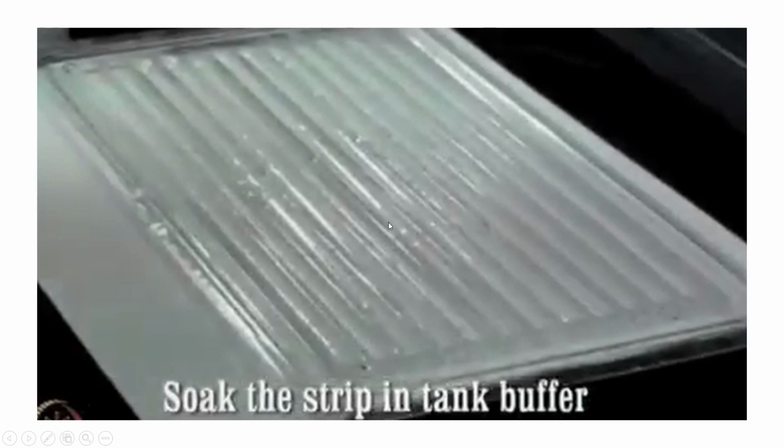The specific strips are soaked in the buffer. Whatever buffers we were talking about in the first equilibration and second equilibration, that's how we do it. And after keeping it in the specific racks, there will be SDS gel below this. So you'll be keeping that specific IPG strip, and you'll also need to load the ladder here.